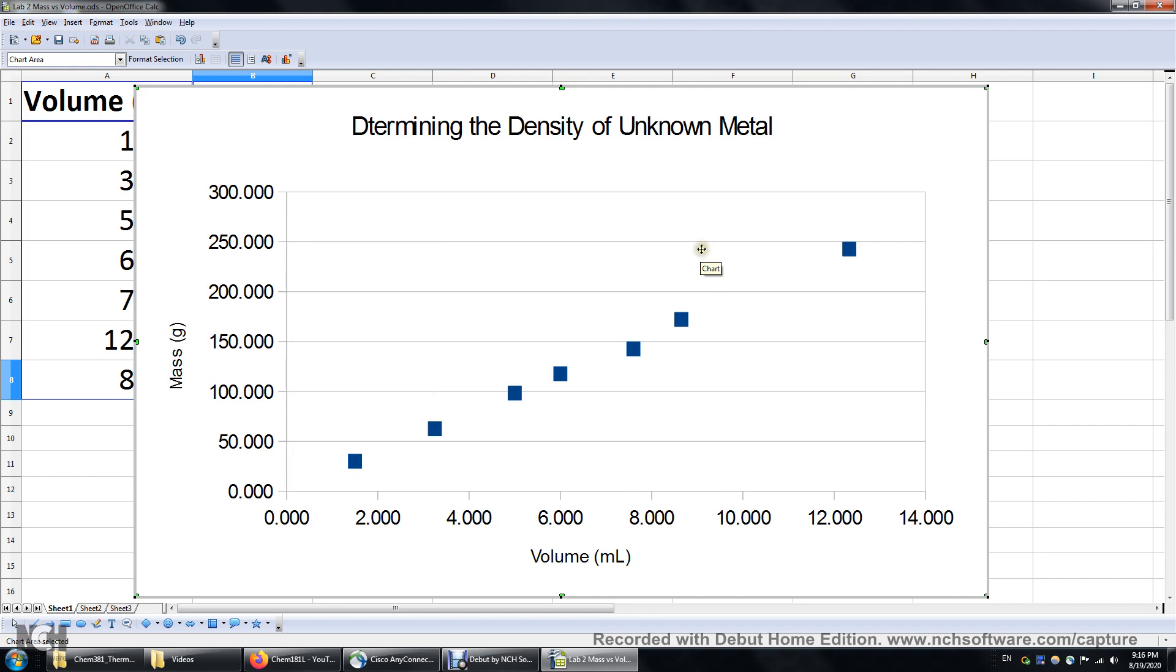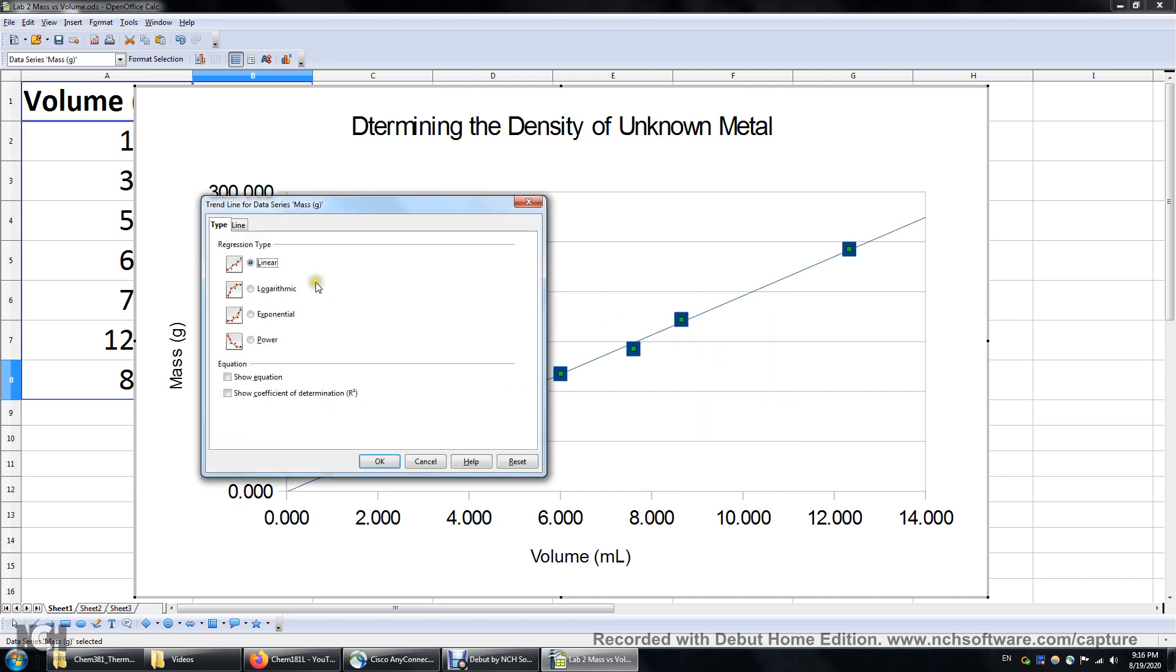Now we'll do a linear regression. Right click any of the seven data points and then insert trend line. It's going to be linear. We will show the equation and the coefficient of determination. We know it's linear because mass equals density times volume. And over here you can change the style and color of the line.